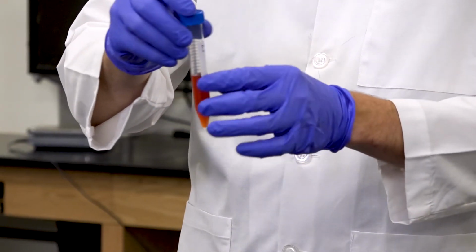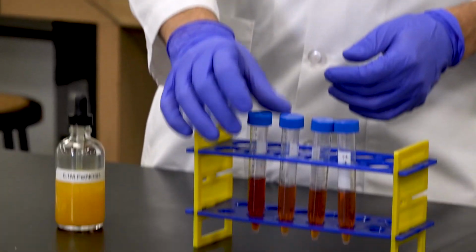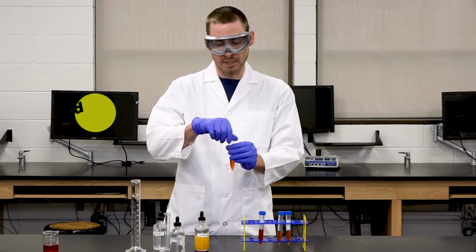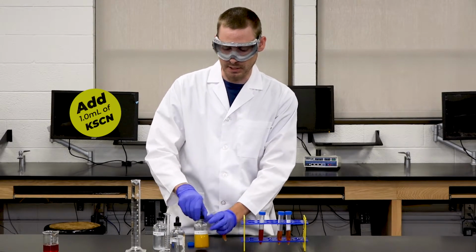Cap that and shake it up a little bit just to disperse it. And then to the second test tube, we're going to be adding 1 milliliter of the potassium thiocyanate solution.